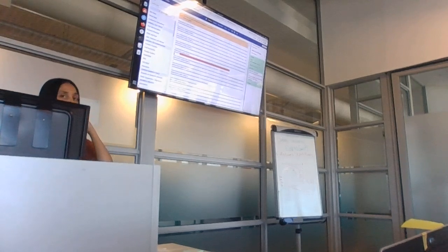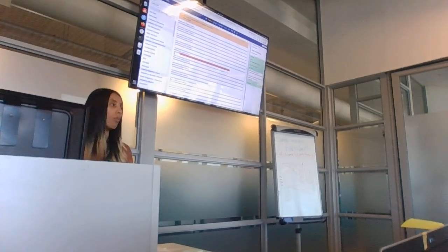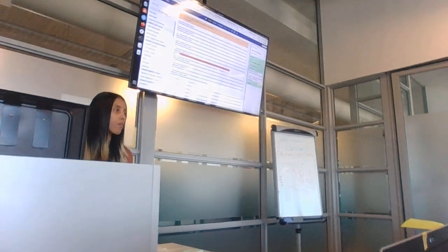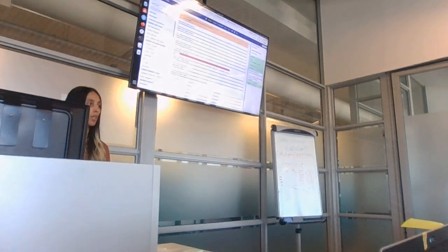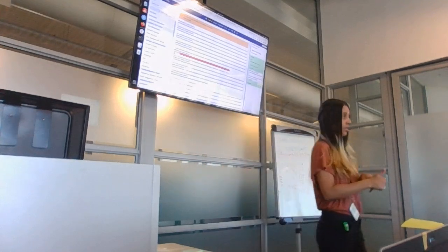So you can run multiple workflows. My question is: when you reach Kraken, was the data to analyze coming from the collection? We just made it like that in the workflow. So if you look at the workflow, the answer is yes.